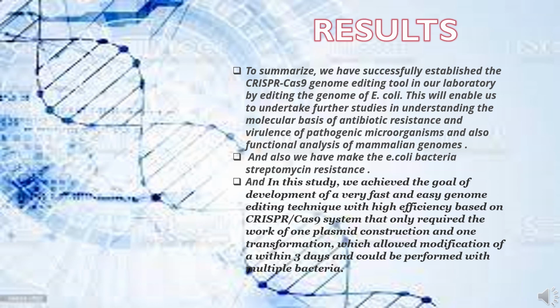And also we have made the E. coli bacteria streptomycin resistant. And in this study we achieved the goal of development of a very fast and easy genome editing technique with high efficiency based on the CRISPR Cas9 system that only required the work of one plasmid construction and one transformation, which allows the modification within 3 days and could be performed with multiple bacteria.